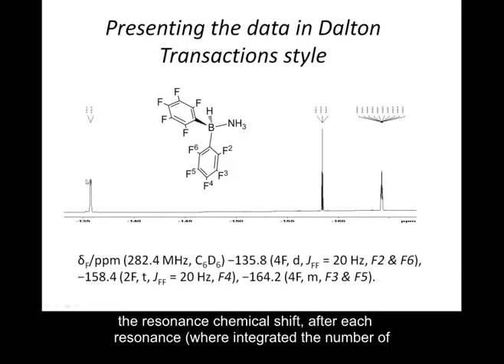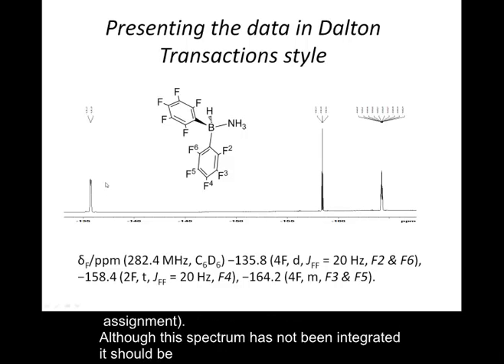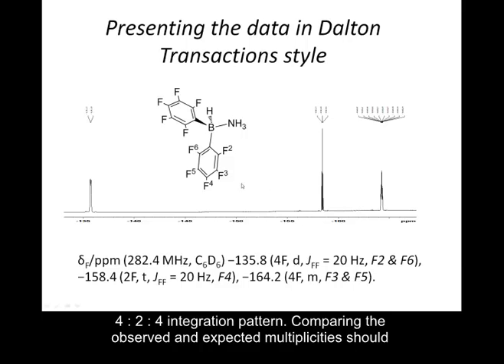It is customary to read the spectrum from left to right, starting with the highest values of chemical shift and moving to the lowest. The first signal is at minus 135.8 ppm. Looking at the intensity, there are four fluorines. It is a doublet. The coupling constant, expressed as J in italics with subscript FF — because it is a coupling between two fluorine atoms — is 20 Hz. The signal is assigned to F2 and F6.